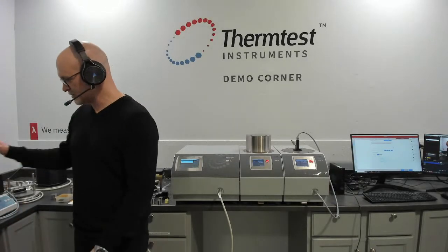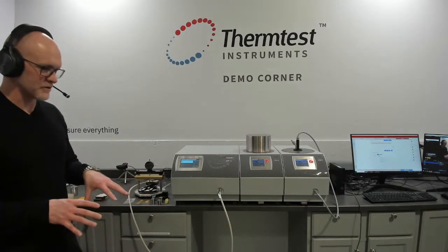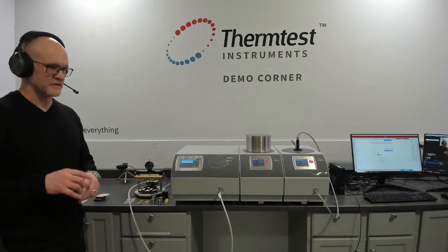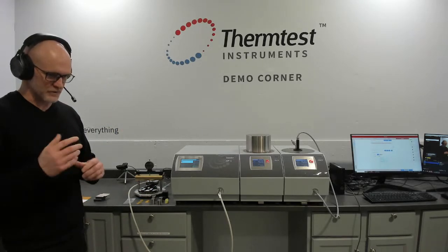Measuring thin films with the TPS2. Tradition here in our demonstration corner is we do a quick loop around and show all the instruments that are available here for demonstration as well as one-on-one training.